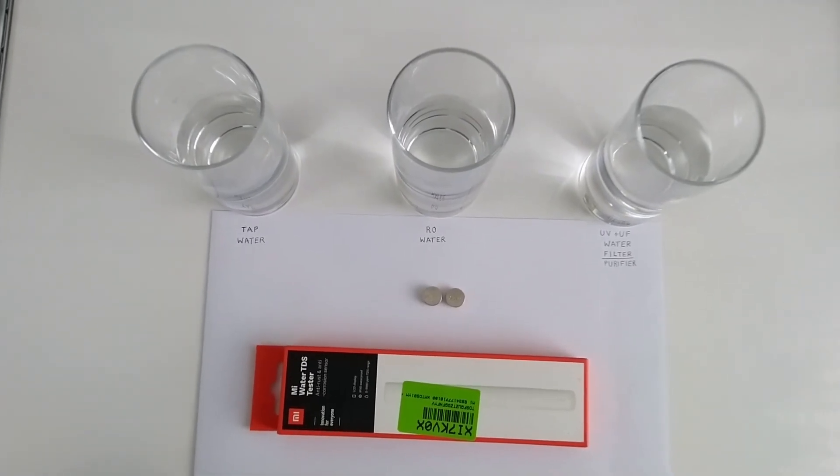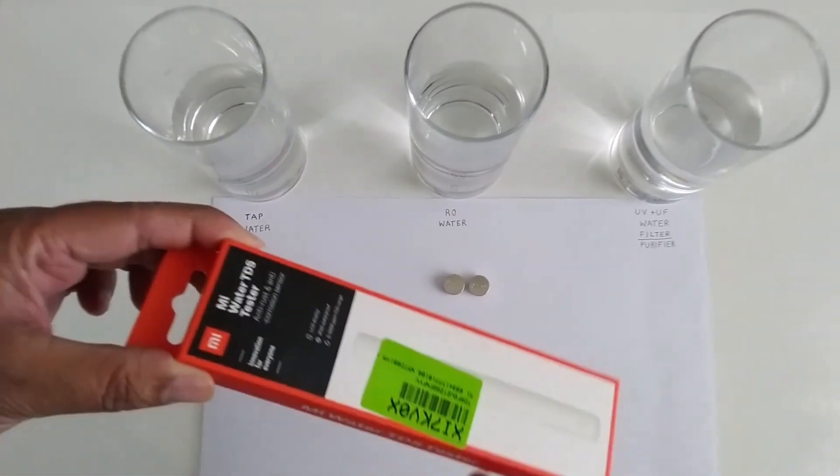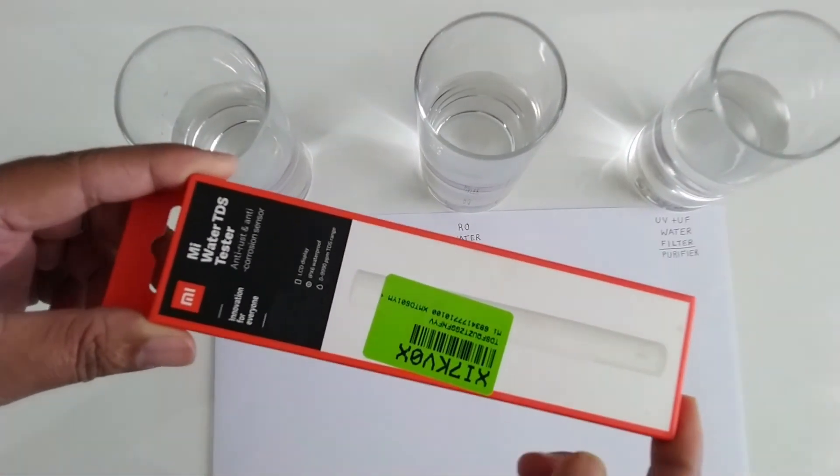Hello everyone, today we will unbox the new Mi Water TDS Tester which just arrived a few hours back.